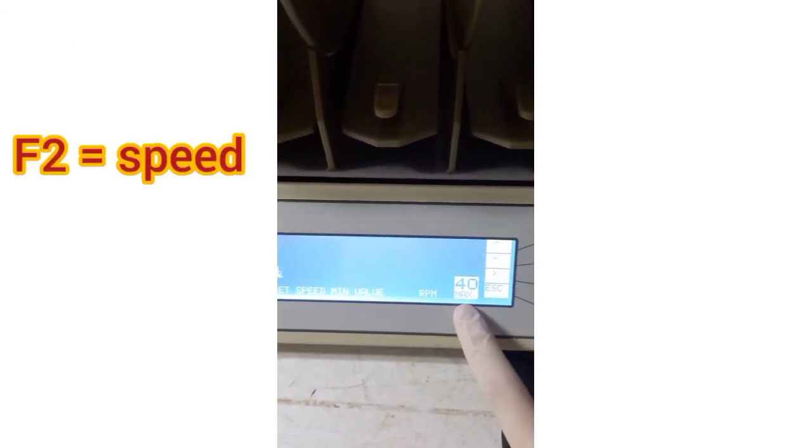Now let's set the rotor speed. From the main menu, press F1 for operation and then select F2 for speed. By pressing the up and down arrows you can change the maximum speed — let's set it at 40. Now by pressing F3 you can set the minimum speed — let's set it at 4. The instrument will then do a self-adjustment. Now it's time to start our test.